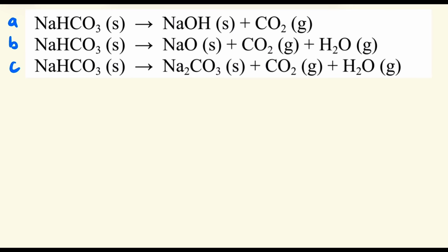Now we will take a look at our data. We started off with 2.41 grams of our sodium bicarbonate or baking soda. We finished with our final product with a mass of 1.52 grams.